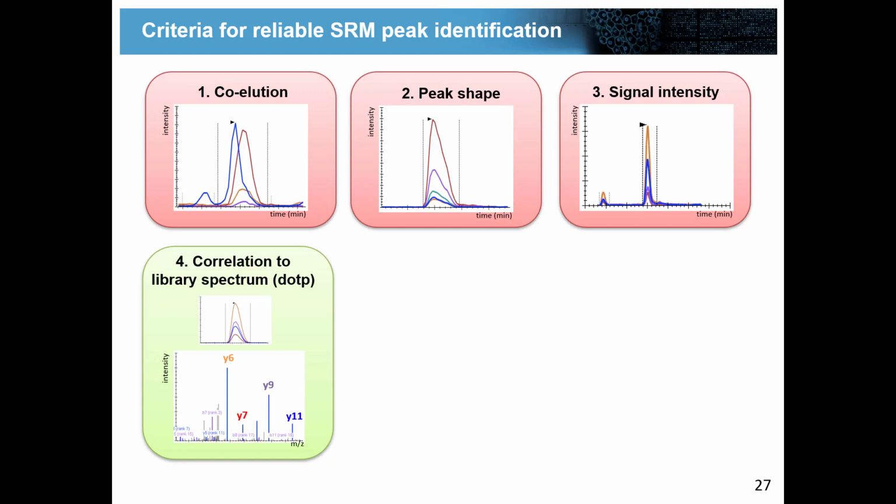again, speaking about a case where we have acquired a library on a different instrument, when we did a Q-Orbi DDA measurement, and now we are measuring on an SRM TSQ Vantage instrument, you can't expect to have a similarly good dotp value. Keep a little bit in mind, where does this library come from? Is it really from me, from the same instrument? Then I would expect you should get very good dotp values. If it's a library taken from the internet, measured on a different instrument, the values will be much poorer.